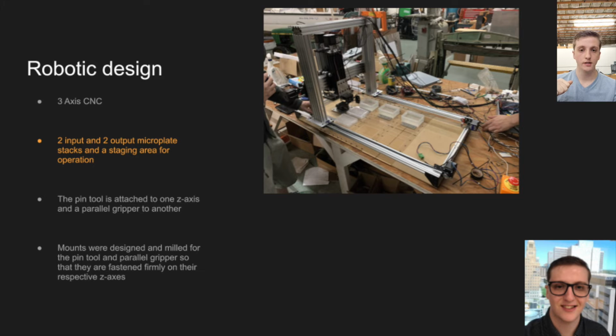So that's 8 microplates in the chemical input stack and 8 microplates in the recipient input stack, which is great. That means that it can do up to 8 pin transfers, and the scientists can leave, check their phone, and they'll get a push notification whenever all 8 plates have been processed, and they can come back, unload them, and they could do another run if they wanted to, or they can put the robot away. So that's great, and Mayo Clinic loves that.